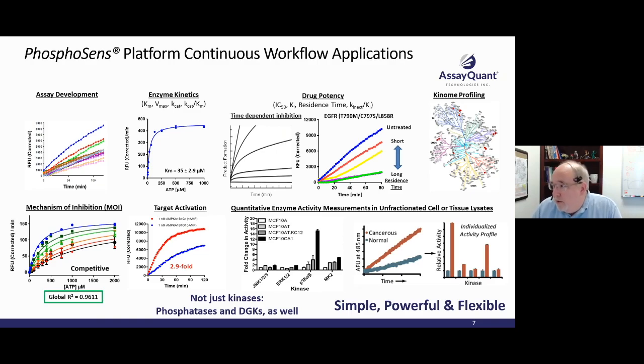But to address your question, can we do the red format for phosphatase reactions as well? Absolutely. We do the reaction. We can follow it kinetically with magnesium. If we then add the europium, we can get that immediate read there. And here it's a signal decrease assay.